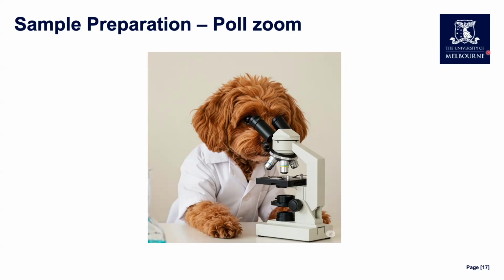Okay, so for question number 1, the question is, what is the best choice of cover glass for most confocal microscope applications? In this case, it is the one that 88% of you selected, which is number 1.5 cover slips or 170 micron thickness, which is good to see. The second question is, what should you take care with when choosing an antibody panel? The correct answer here is that your secondary antibody should target the species that your primary antibody was raised in. So that's the second question there. And again, a large proportion of you got that answer correct, which is good to see.